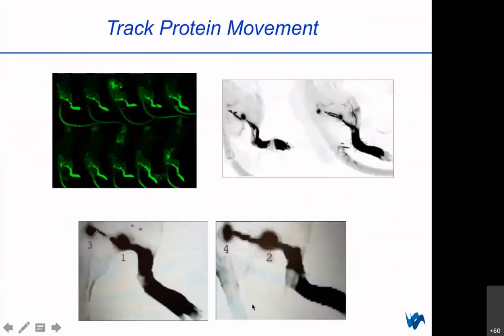One special researcher is using tracking of movement with the Sapphire, and they are starting to get some tremendous results. So here we show that the fluorescently labeled antigen was injected subcutaneously into the mouse hind paw. The animal was euthanized, and fluorescence from the draining popliteal, or the back of the knee, and sciatic lymph node were measured. Numbered green circles indicate areas where the signal was to be measured.